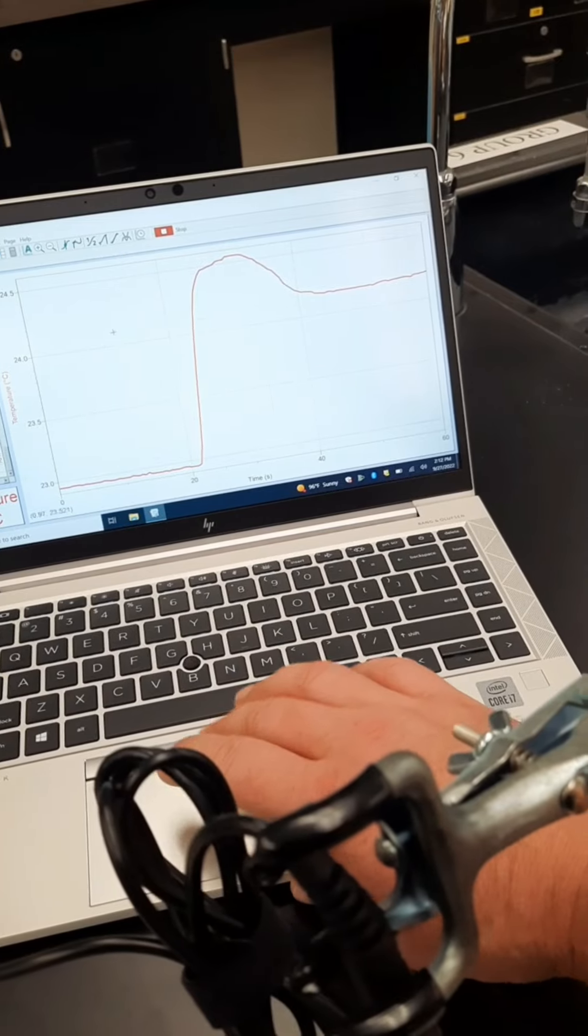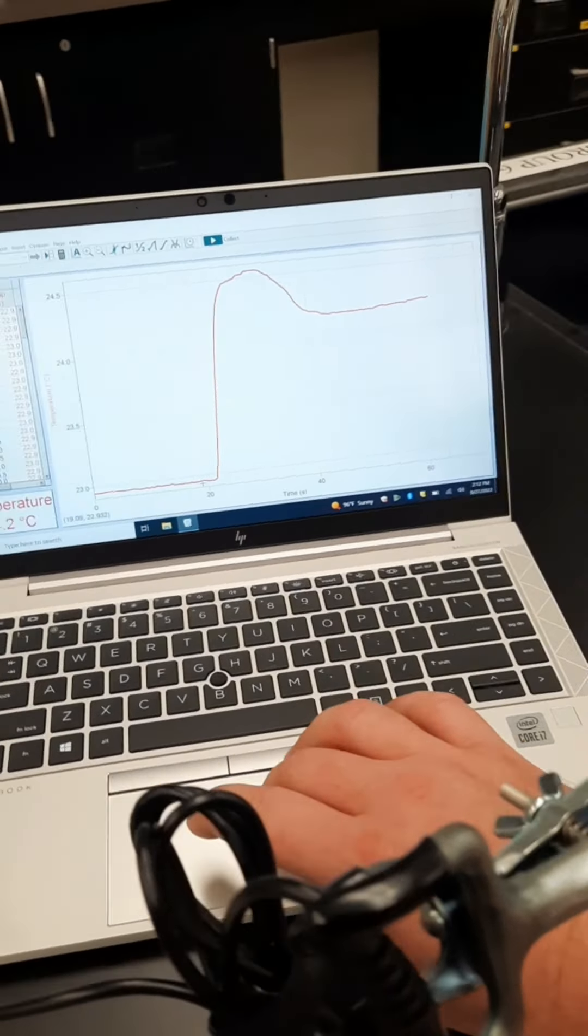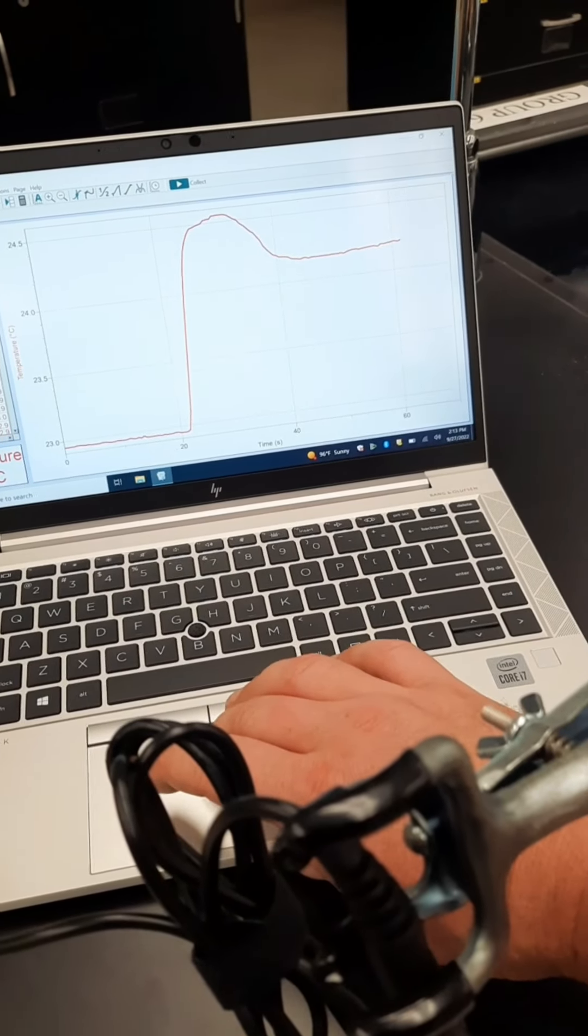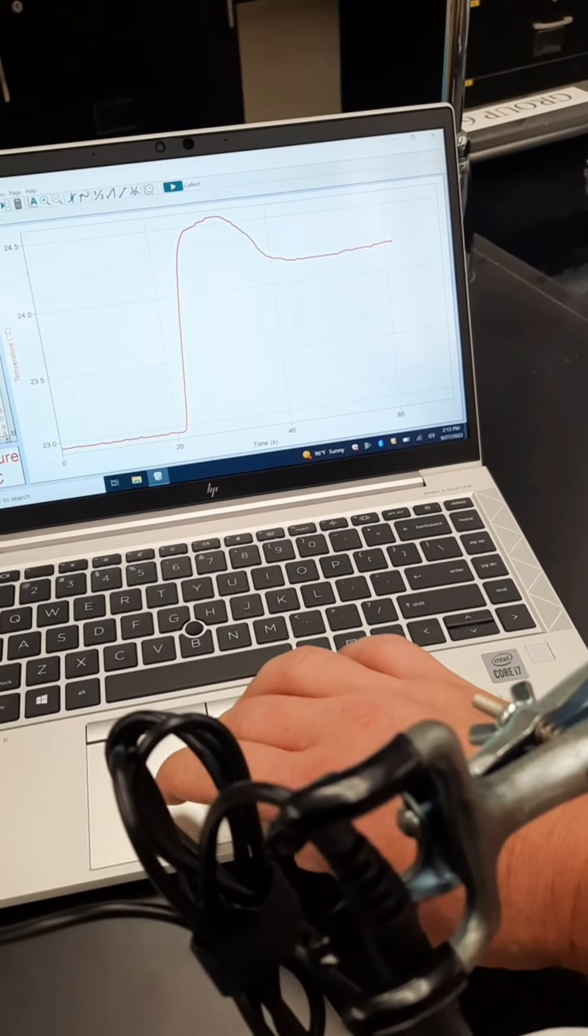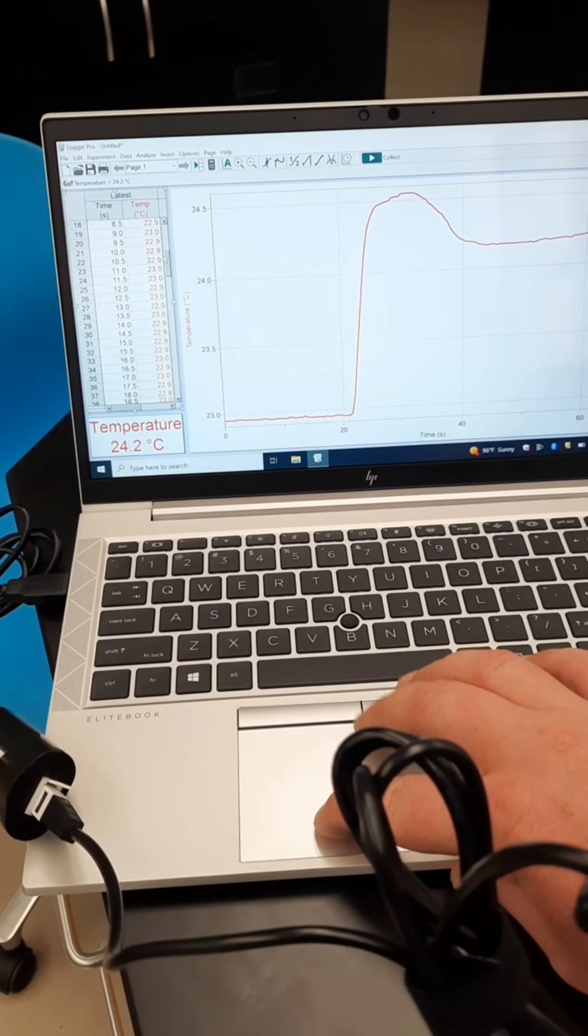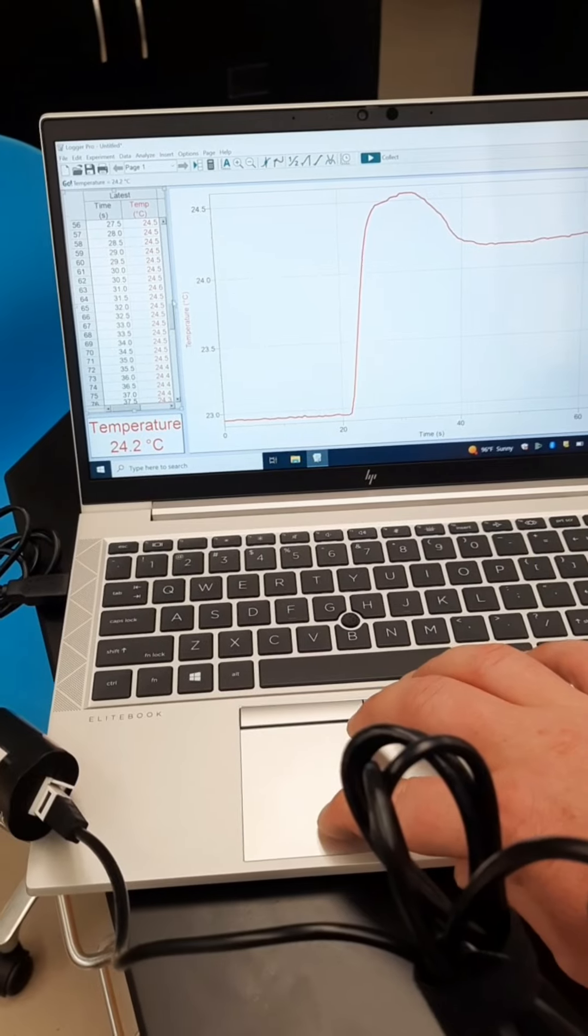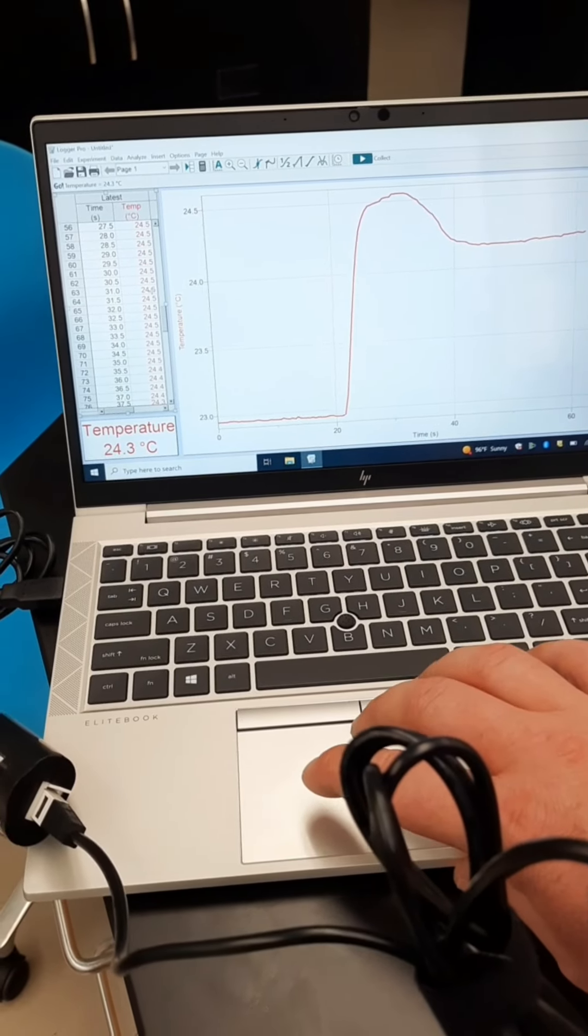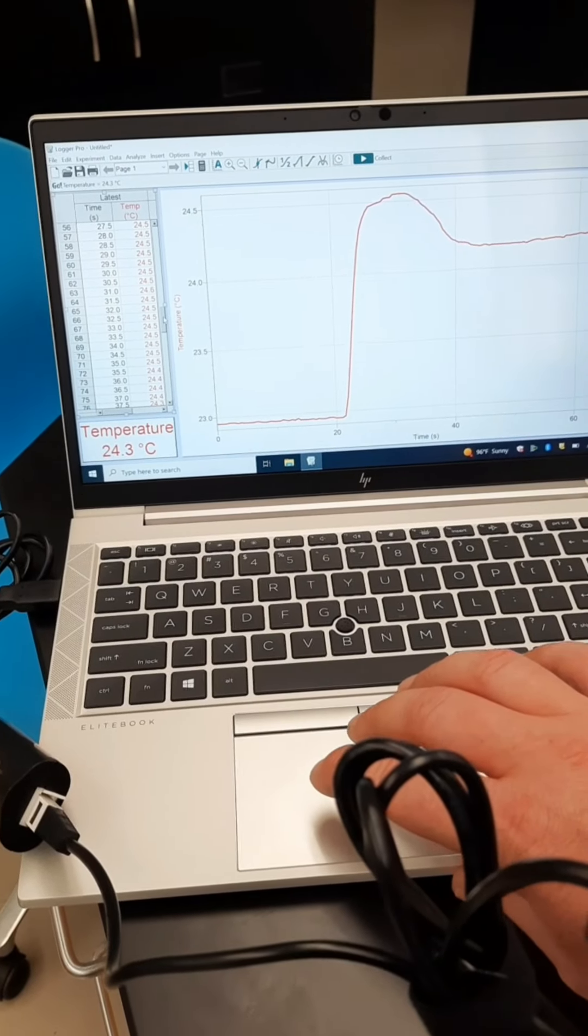We can hit the stop here. So the temperatures we want are the initial temperature, the lowest we observed and that was 22.9, and the highest up here, we can scroll down through this and see that it was about 24.6. So from there we can see our total change in temperature.